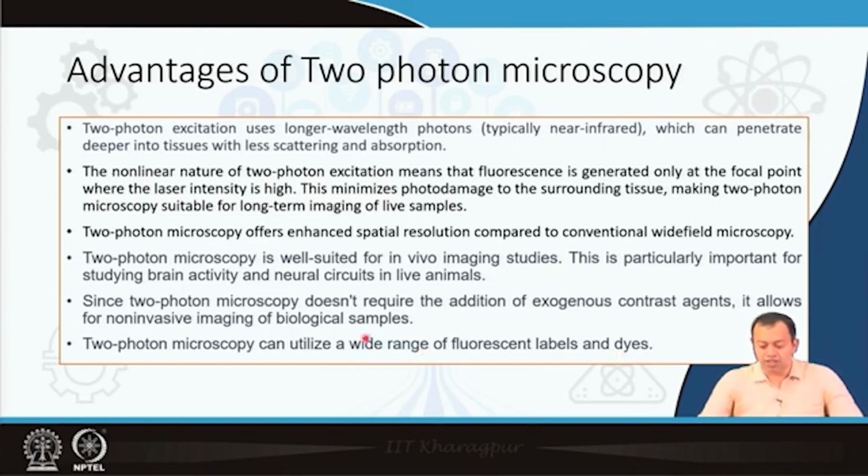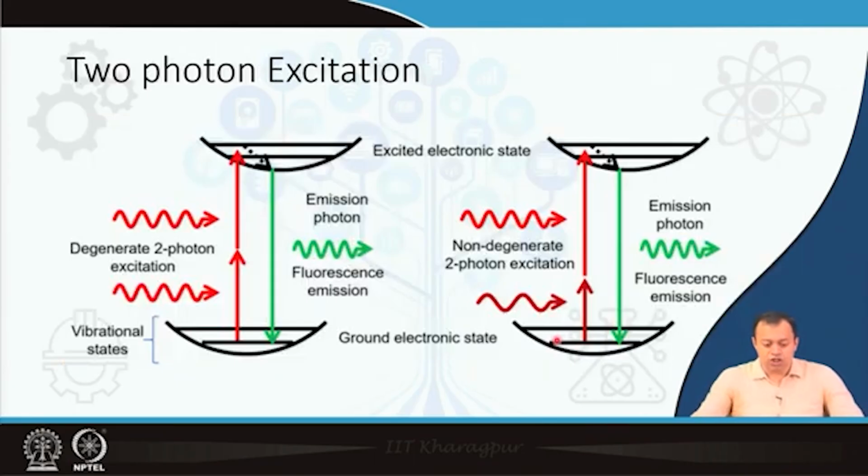They are trying with certain inherent proteins that can absorb, can show non-linearity, but that is not something that we are going to discuss today. We will discuss the general 2 photon microscopy which uses fluorescent labels and dyes. And since that particular frequency is optically transparent, it has less scattering, and it can penetrate deeper inside the brain.